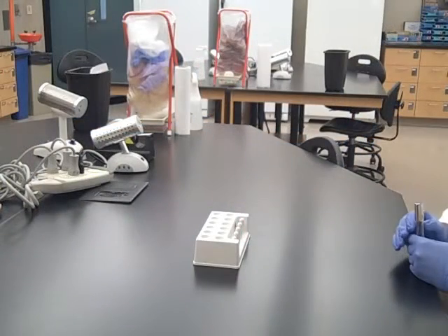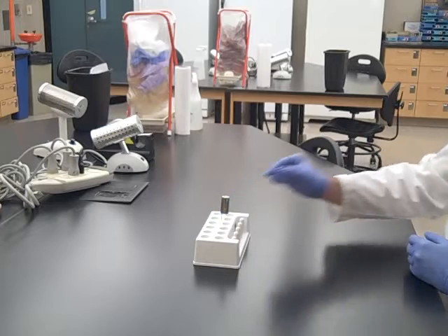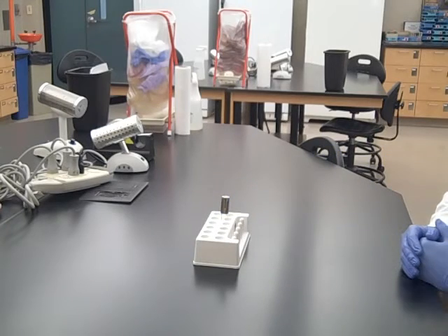In the microbiology lab, test tubes must always be carried in a rack. Be sure to never carry them in your hands.